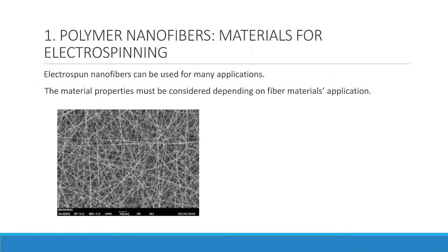Okay. So this is what you get. This is the material that we are making from our machines. Polymeric nanofibers, as you can see here in the SEM image. So moving on to the next slide.